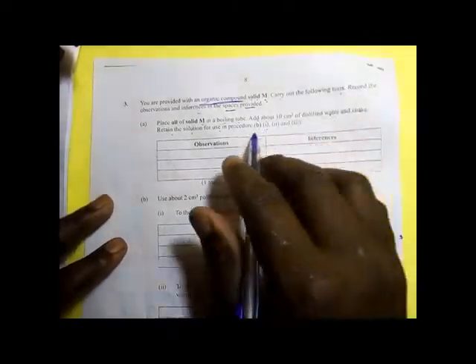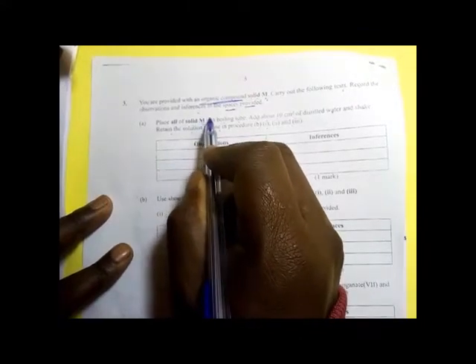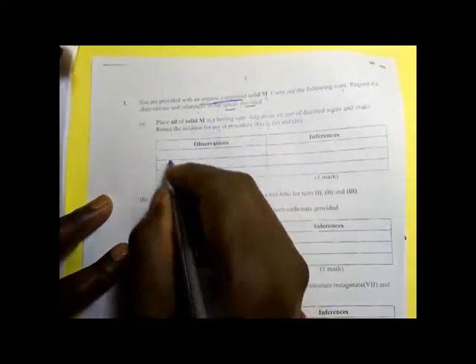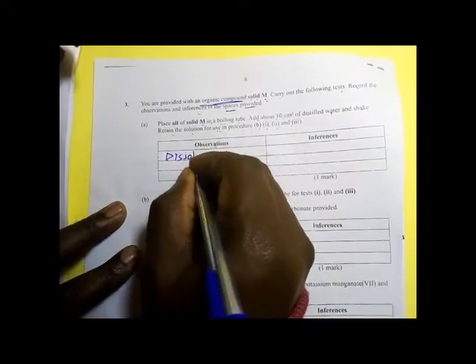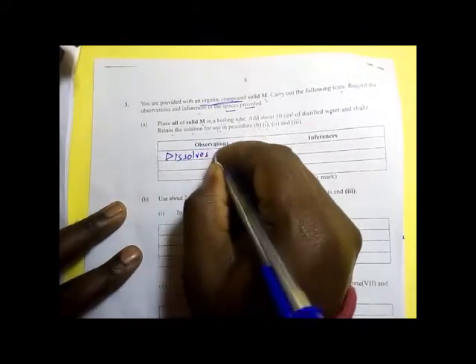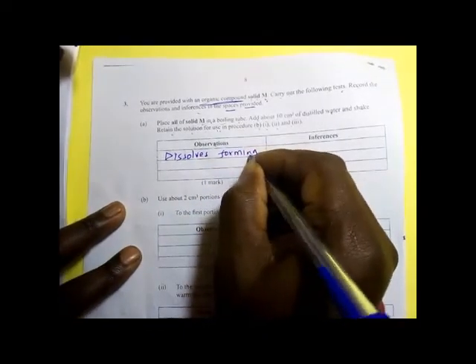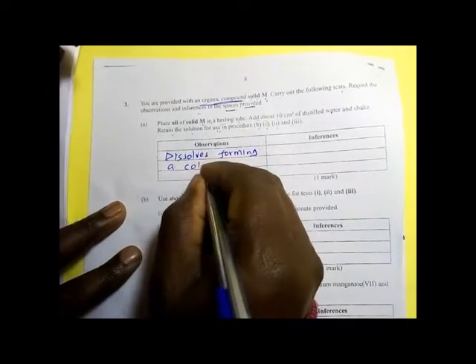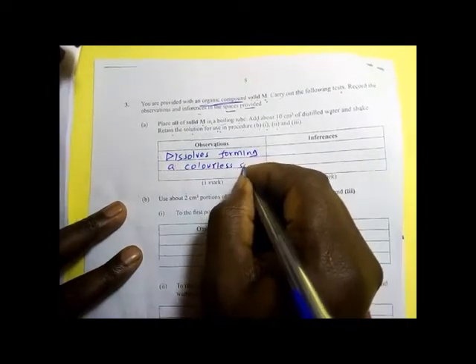So here we want to state the observation. Did the solid M dissolve in water? Yes or no? So, the solid dissolves, forming a colorless solution.